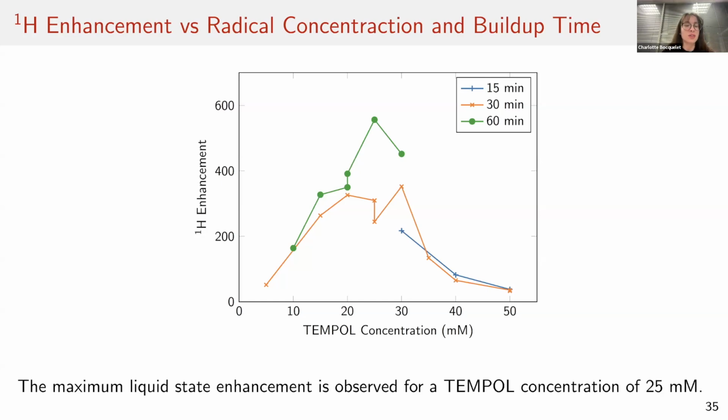There are 3 more questions. So the first one from Adam Gaunt. Did you do any optimization of the pulse sequence for polarization transfer to proton from carbon? And further to this, do you see a water signal from exchanging protons? And if you expand the range of molecules, would you have to adjust the sequence to tolerate varying proton exchange rates?